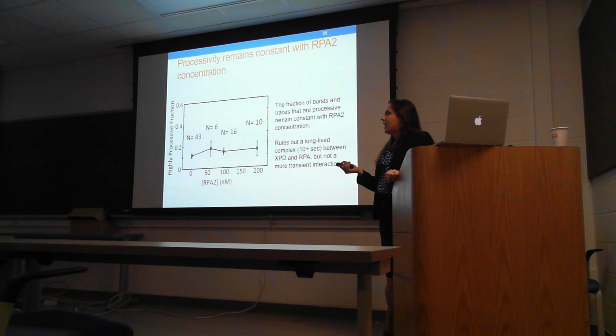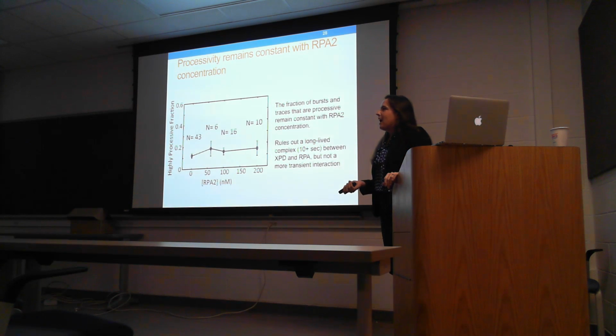In my dipping experiments using FRET, I did not see any FRET signal, indicating RPA is not there. However, I rarely saw any FRET signal at all. So it was not a successful experiment. I will say this is supported.